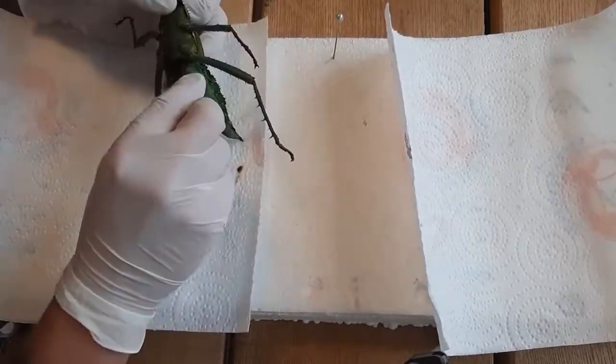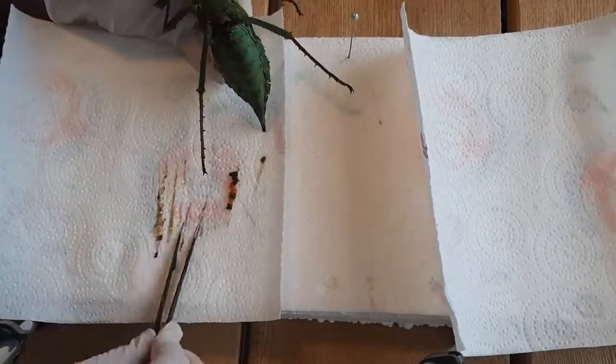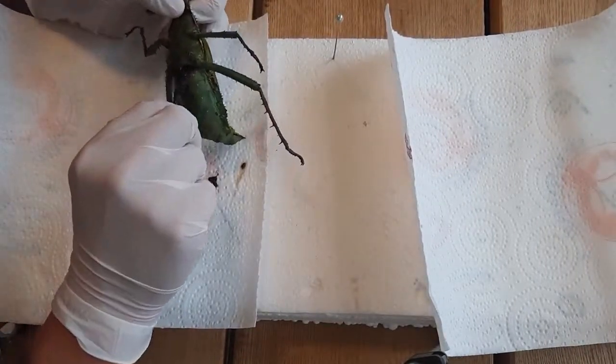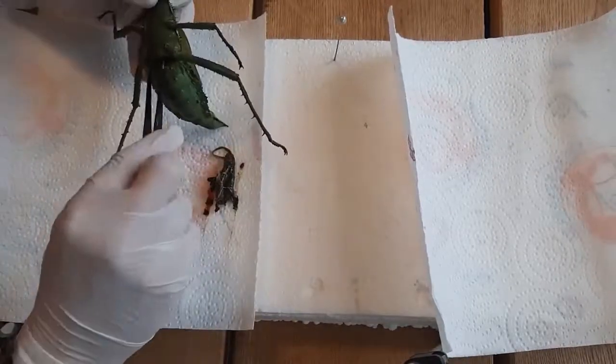You start by making a cut between the two segments of the thorax and abdomen. There is a membrane there — you can cut the membrane relatively easily — but you can see there is a stomach inside.